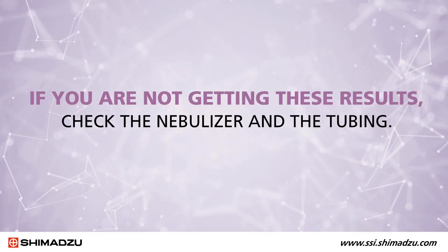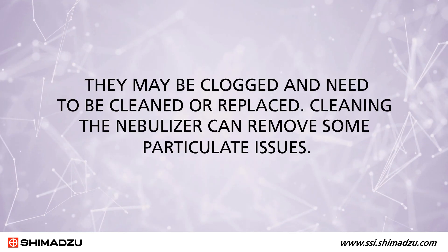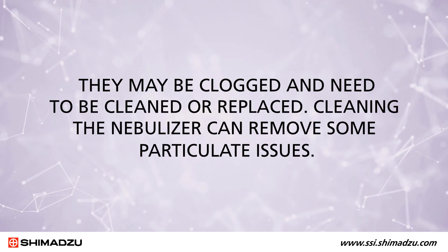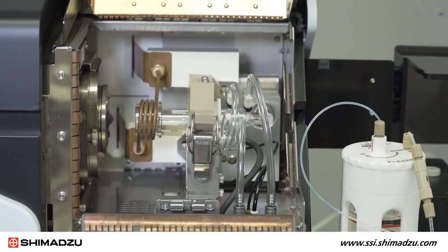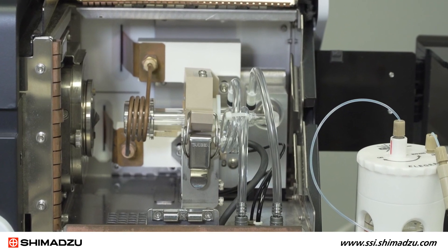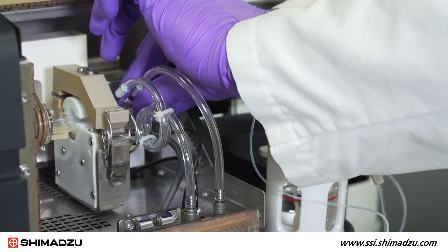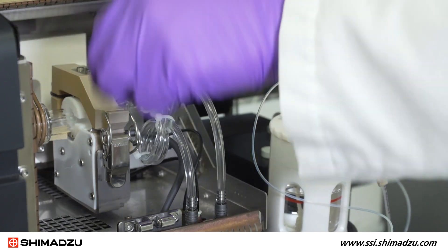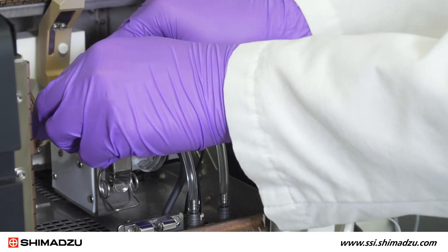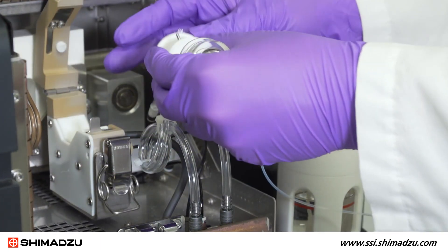If you are not getting these results, check the nebulizer and the tubing. They may be clogged and need to be cleaned or replaced. Cleaning the nebulizer can remove some particulate issues. Next, the torch and interface cones can be visually inspected. The torch should be checked for evidence of deposits or blockage on the torch injector and also for wear, which appears as white discolorations or melting at the torch tip. If you find blockage or wear, you should consider replacing the torch.